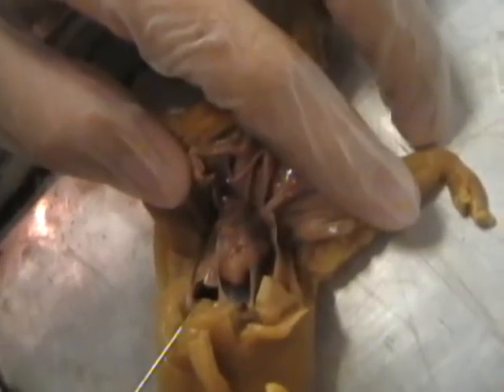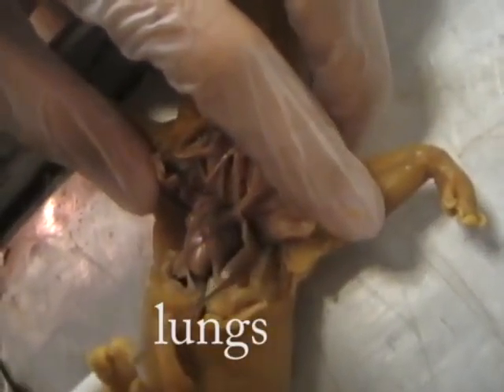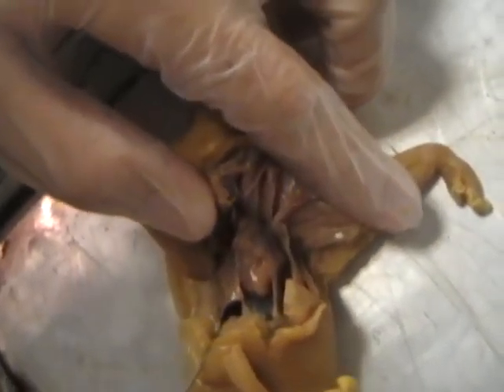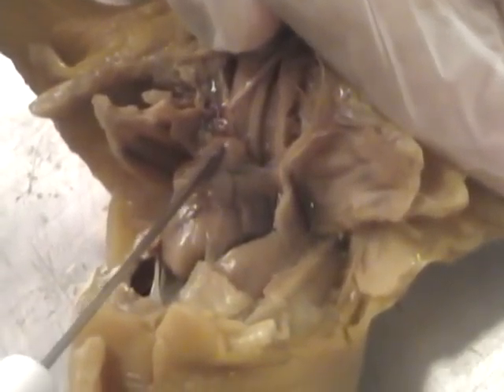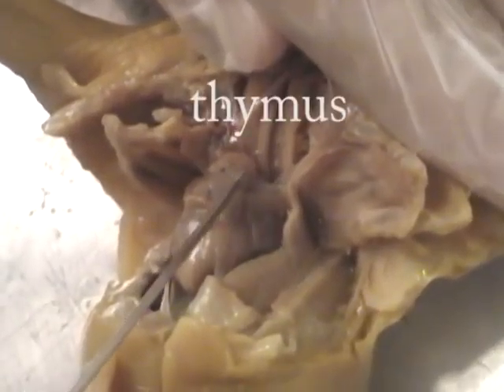Okay, so right there is the lungs on each side. If we pull the skin back, you can clearly see it. Each on the side of the heart. Right here is the heart. And I do believe that's the thymus.